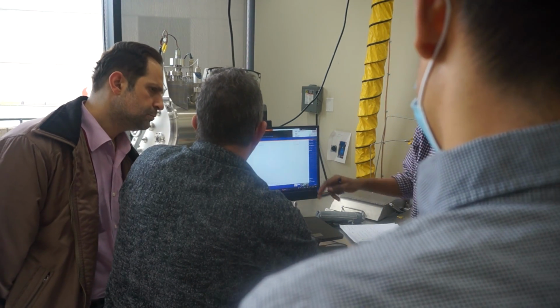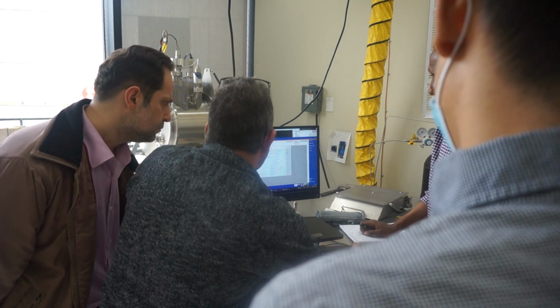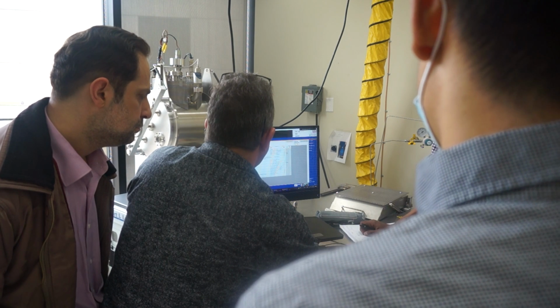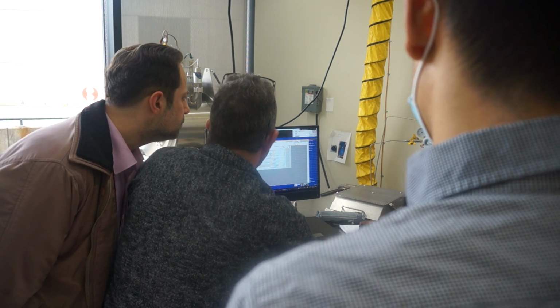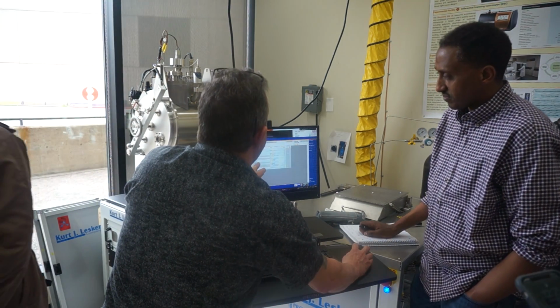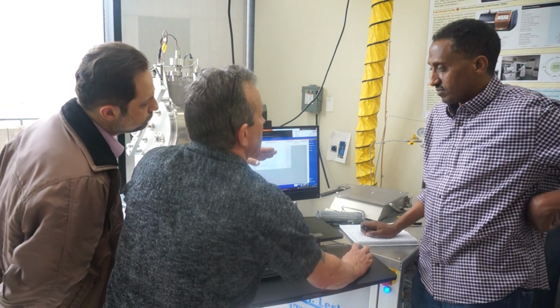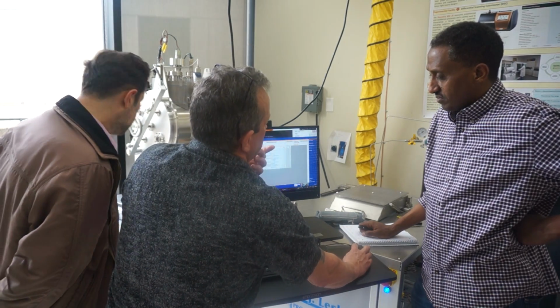Well, you would create a new recipe. The new recipe would look almost identical to this, with a different name, but this step right here would be different. The wording of this step would be different, and then whenever you open a recipe, that will be different. So if you were running TDMAT versus TMA, you'd have TDMAT here. You would have a different sub-recipe, and the process recipe would have a different name.